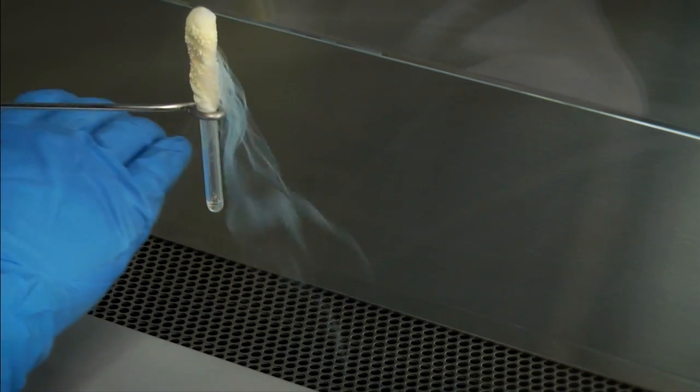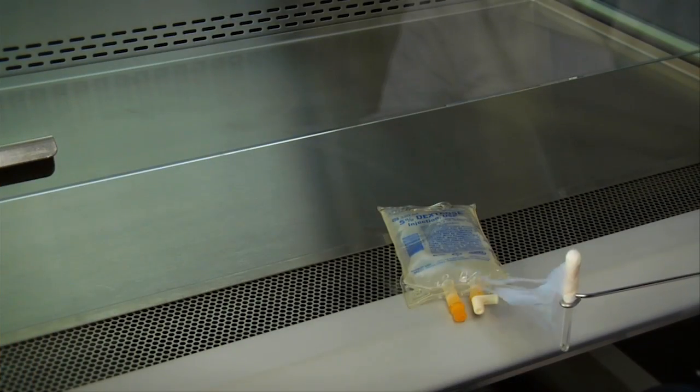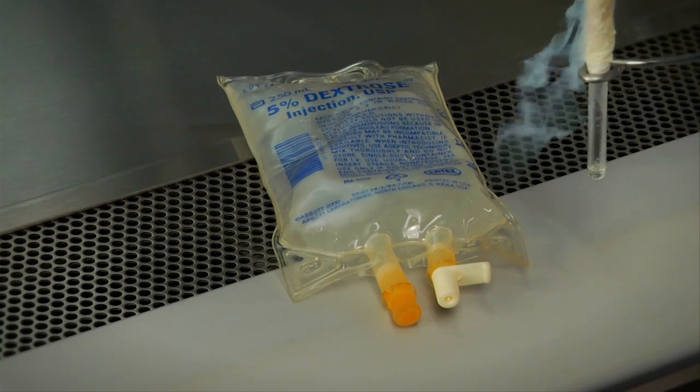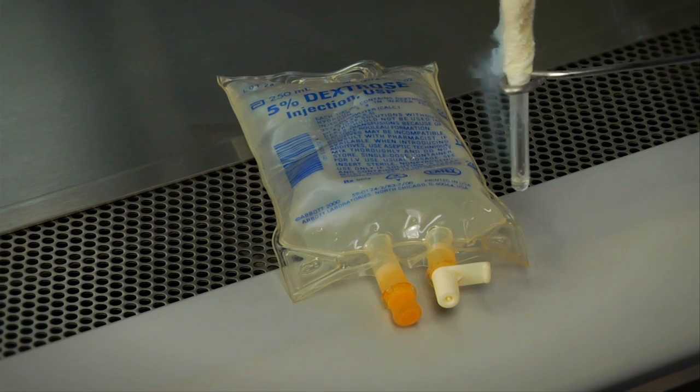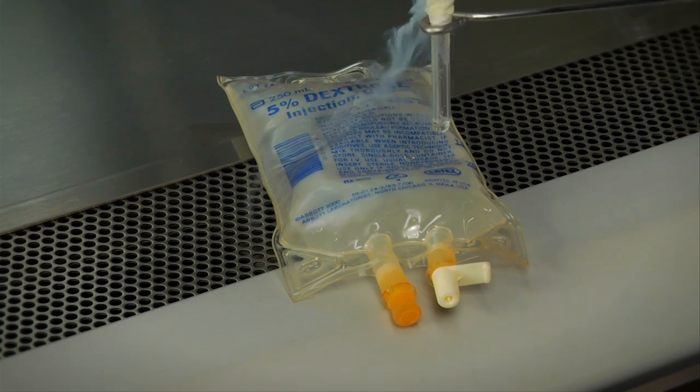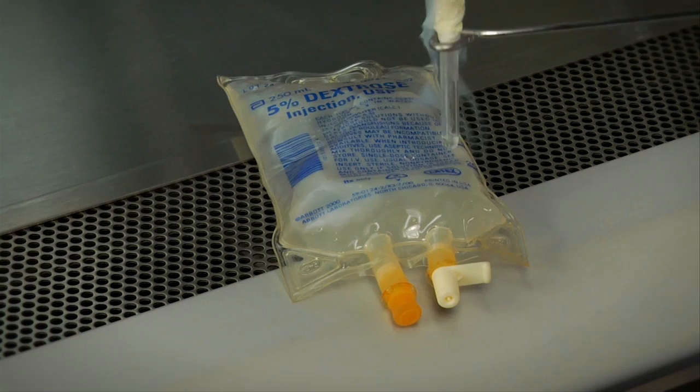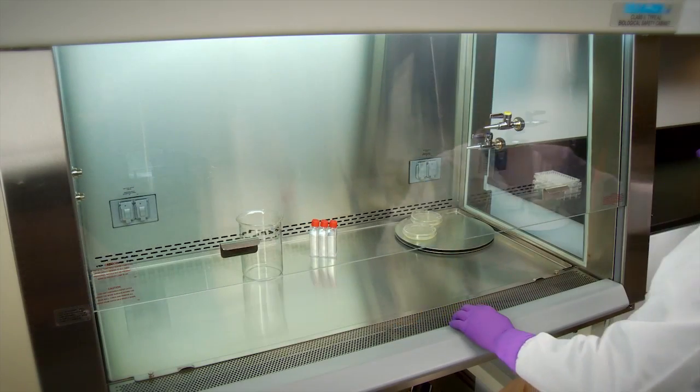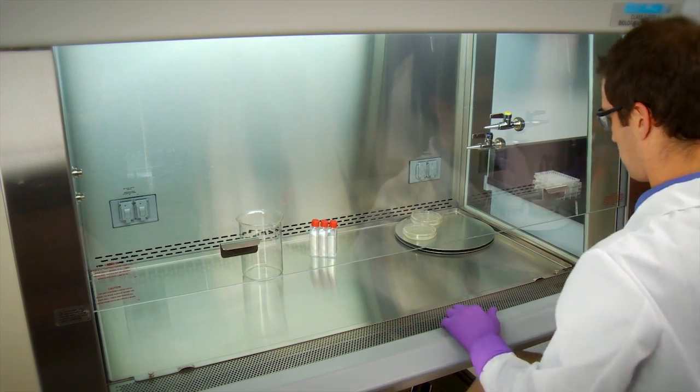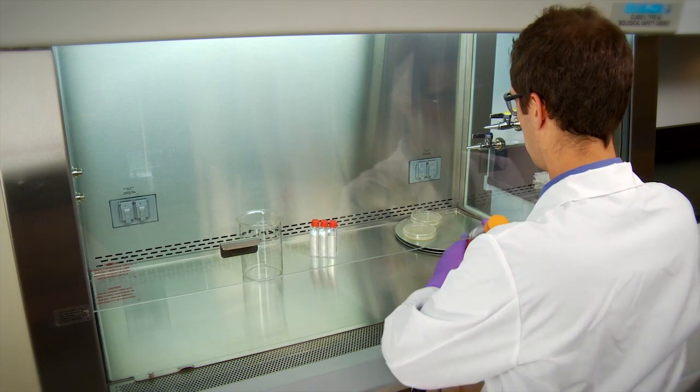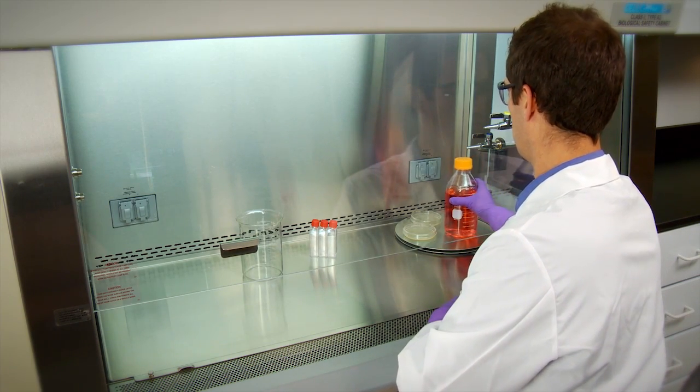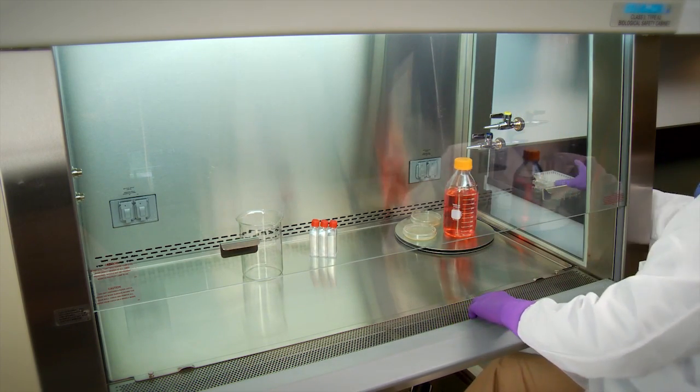Air intake to your BSC is also very important. Remove any items on the intake grills that might block or disrupt the air supply, and be sure the front grill is not blocked, covered, or obstructed. All materials should be placed as far back in the cabinet as possible, toward the rear edge of the work surface and away from the front grill of the cabinet, but still within reach.